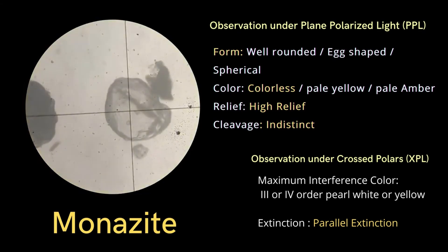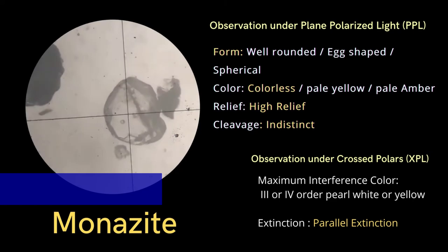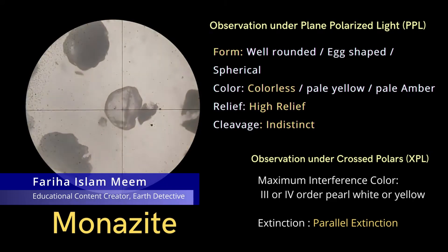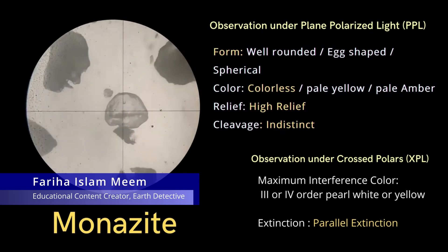Monazite appears well-rounded, sometimes egg-shaped or spherical under plain polarised light. Its color ranges from colourless to pale yellow or even pale amber.